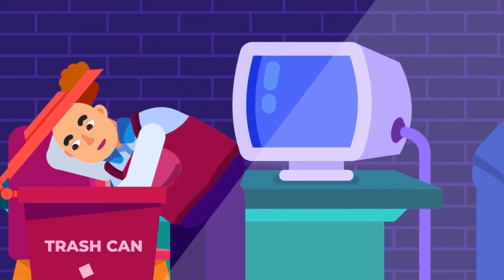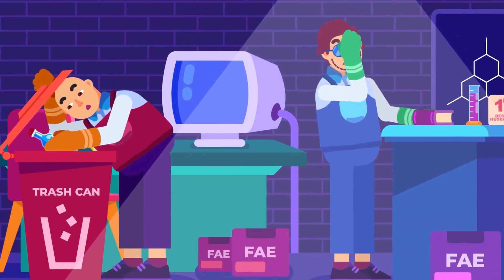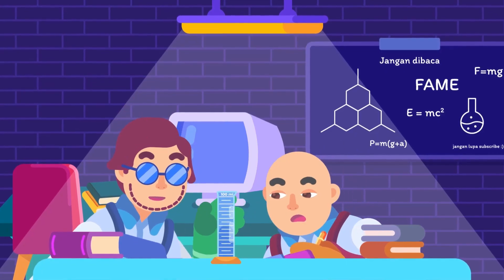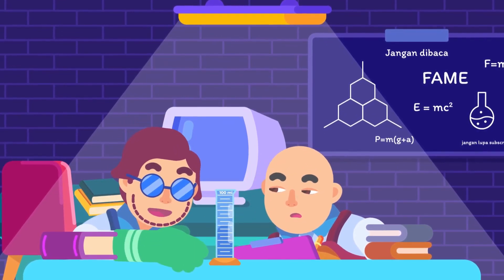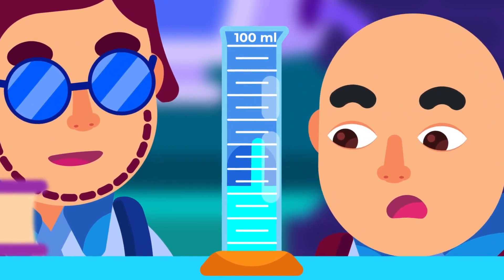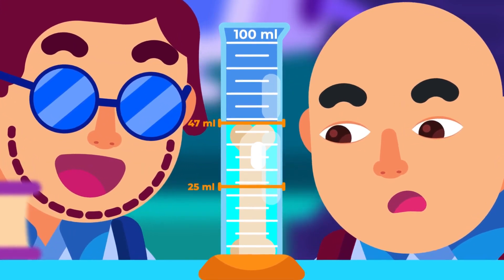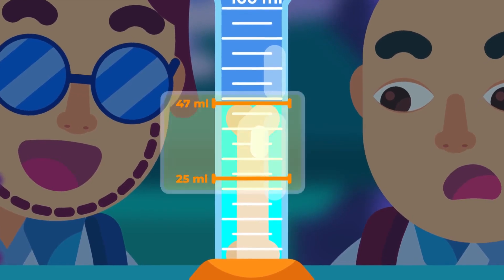The ingenious use of the cylinder is probably in measuring the volume of irregular-shaped solids that may otherwise be difficult to calculate using the standard formula, such as a T-Rex's metacarpal. Suppose we have a 100 milliliter measuring cylinder. Make sure that we put it on a flat surface for proper scale reading. First, fill the cylinder partially with water and record the volume. Then submerge the T-Rex's metacarpal in the water and observe how the water level rises. The difference between the new and original volumes is the object's volume.